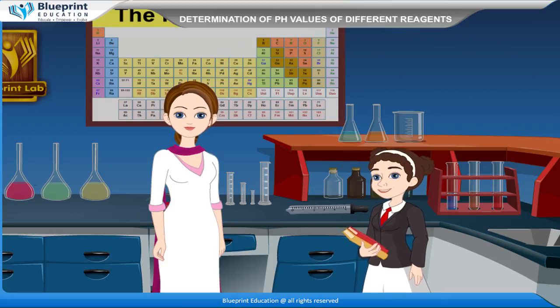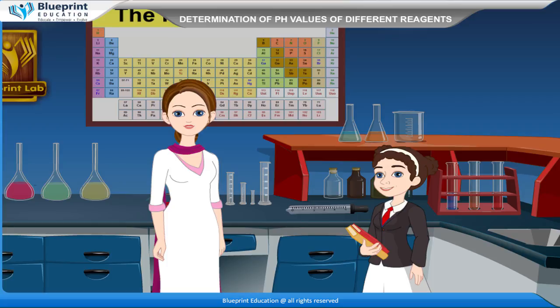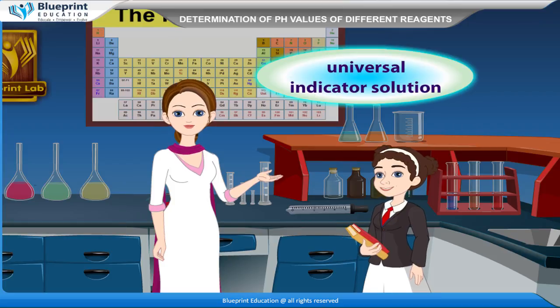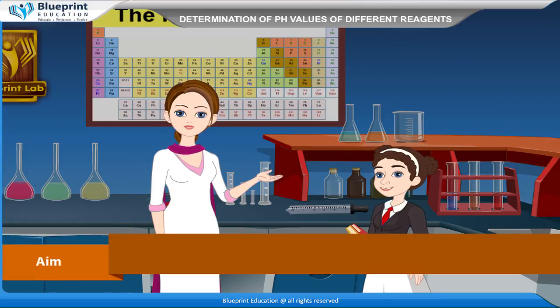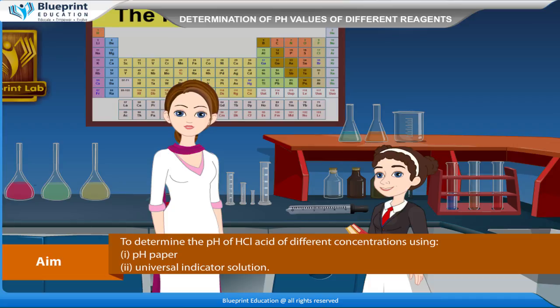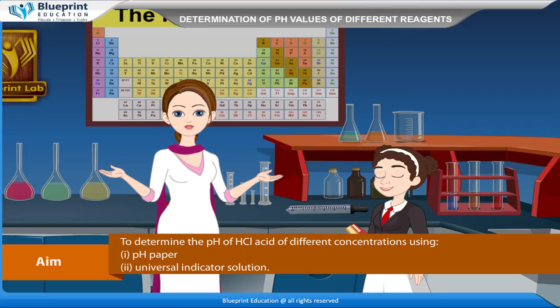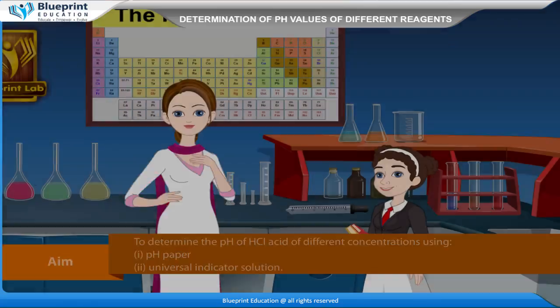Let's do an experiment to determine the pH of HCl acid of different concentrations using pH paper and universal indicator solution. Our aim is to determine the pH of HCl acid of different concentrations using these two methods.